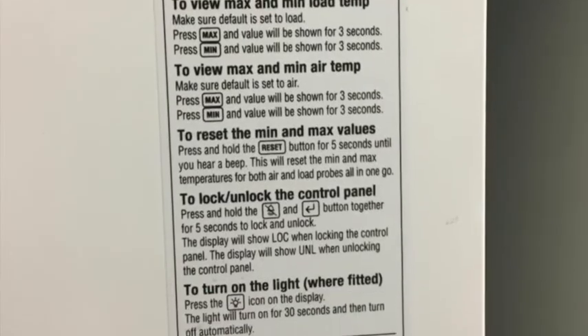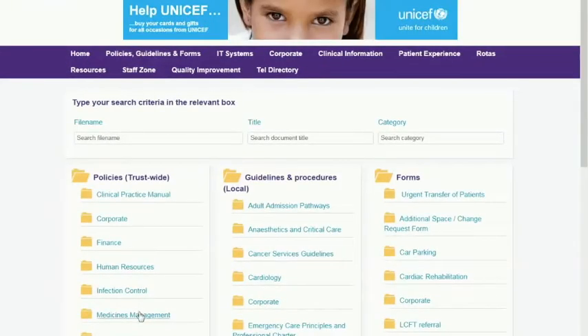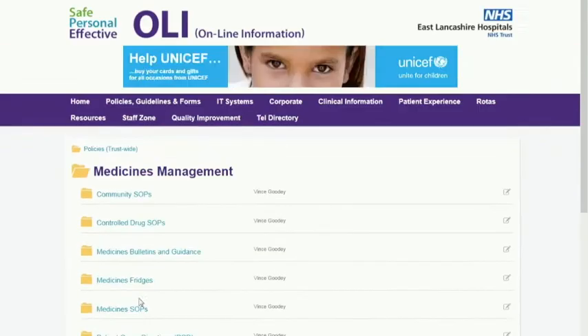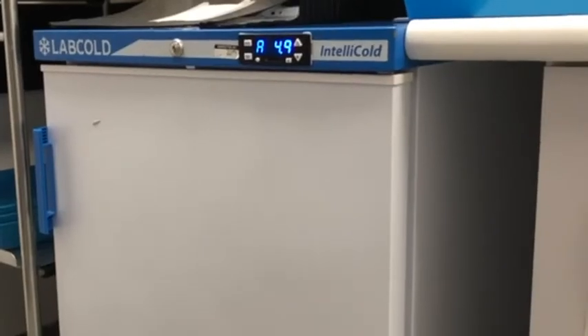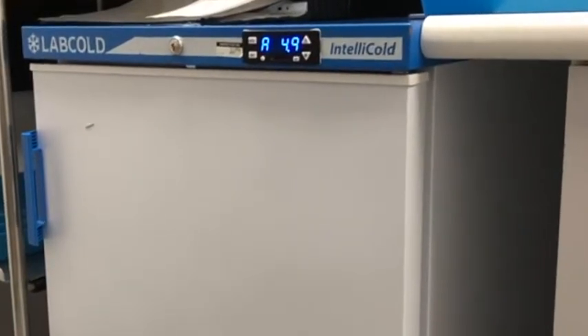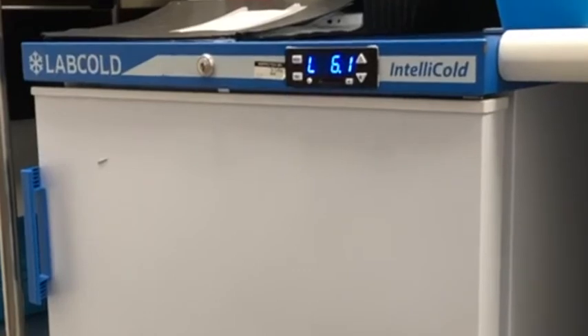There are a number of other fridges in use in the Trust. The modern LEC fridges have good instructions on the door, so follow these. Instructions for the basic operations for all the fridges are available on Ollie in the medicines management folder. The older LabCold is the only other medicines refrigerator that also has a battery backup and a clock.